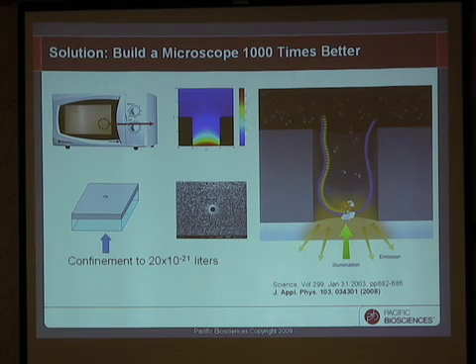It bounces off as if the hole simply wasn't there. Well, the same thing happens at the nanoscale. We now use not microwaves, but visible light photons with a wavelength of 500 to 700 nanometers, and a hole that is now a few tens of nanometers in diameter. The same thing happens. A photon that is transmitted up through a transparent glass substrate and attempts to penetrate through a cylindrical hole in this metallic film is exponentially attenuated over the length of that cylindrical tube.